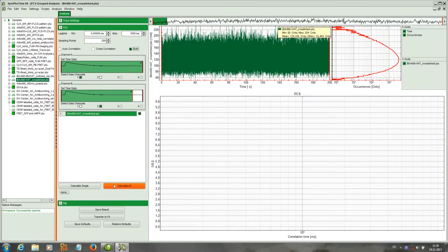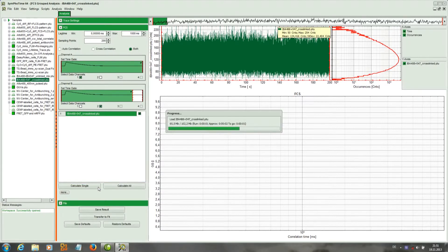If we click now onto calculate single, the FCS curves will be calculated.